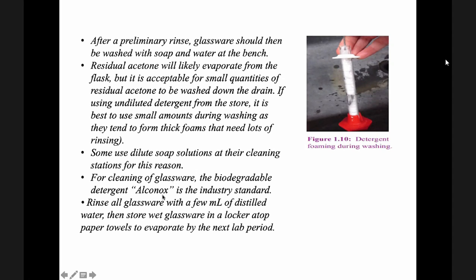So we were able to troubleshoot by checking the distilled water. Before, we just bought commercially available distilled water for battery use because it was cheap. But then we found out the phosphate concentration was very high. So we shifted to another brand. Okay?